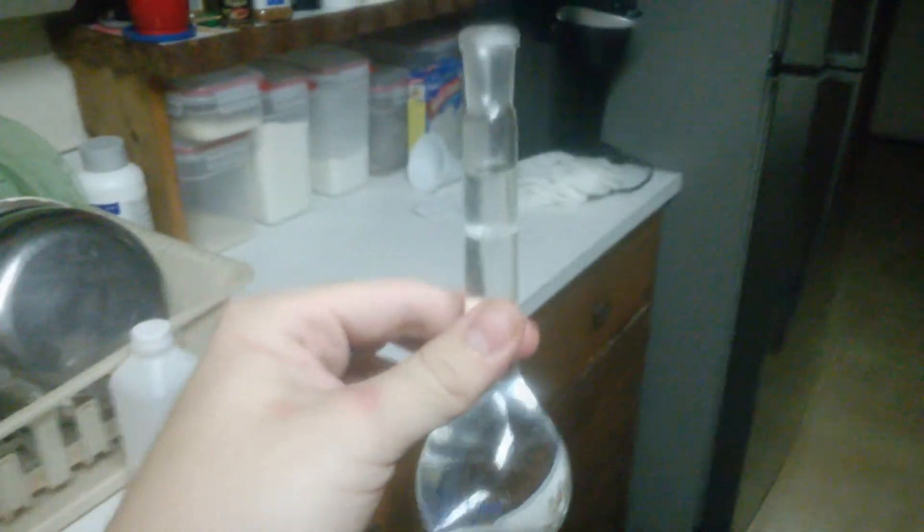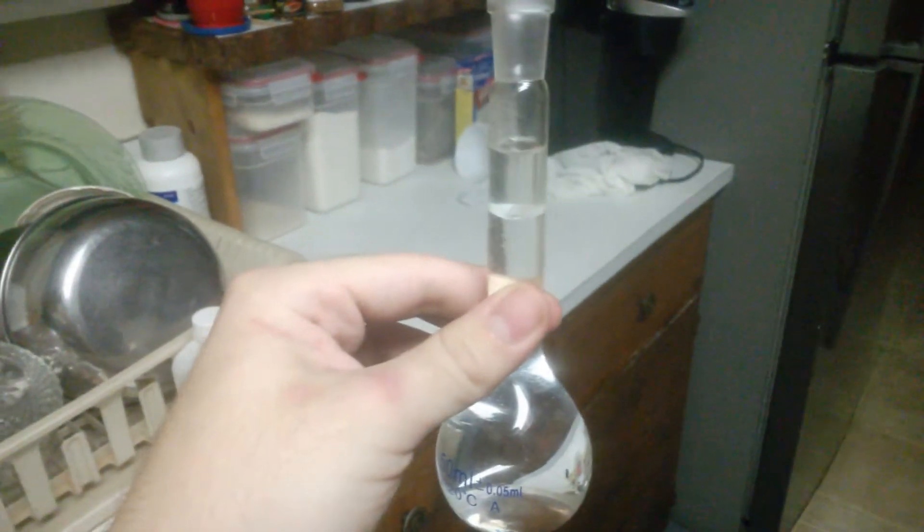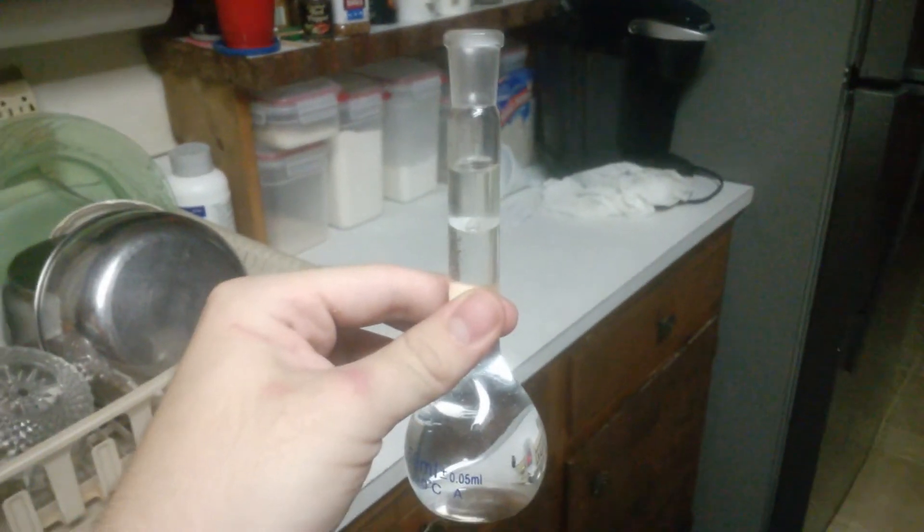We've taken it out of the microwave and moved it to the beaker. We've got about an inch of oil here — complete citrus oil, smells great. I'm about to transfer it over to the bottle right now.